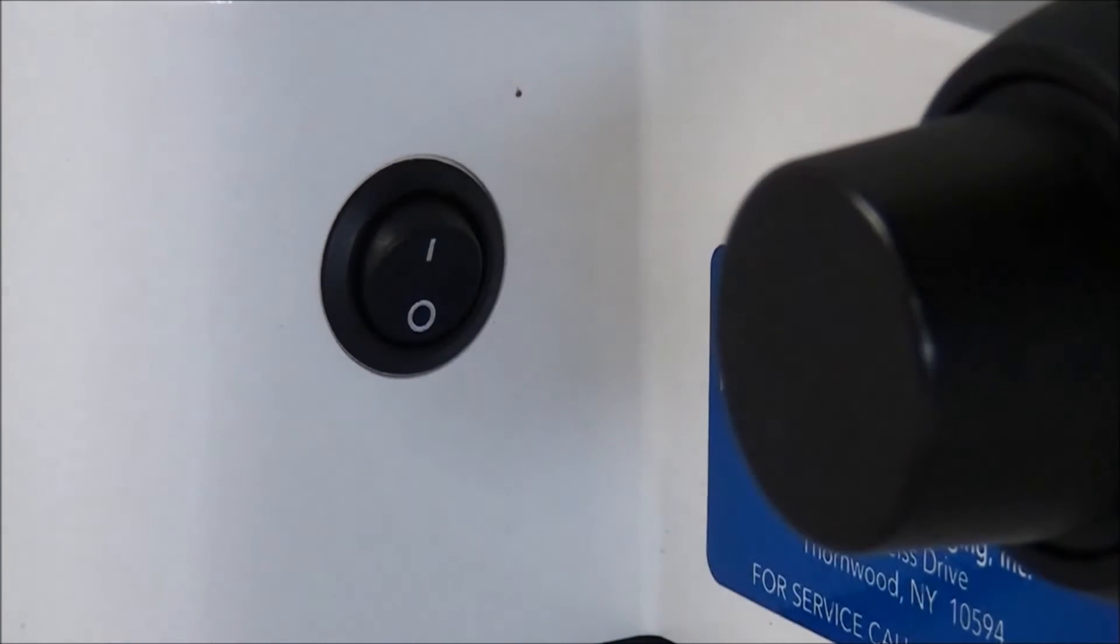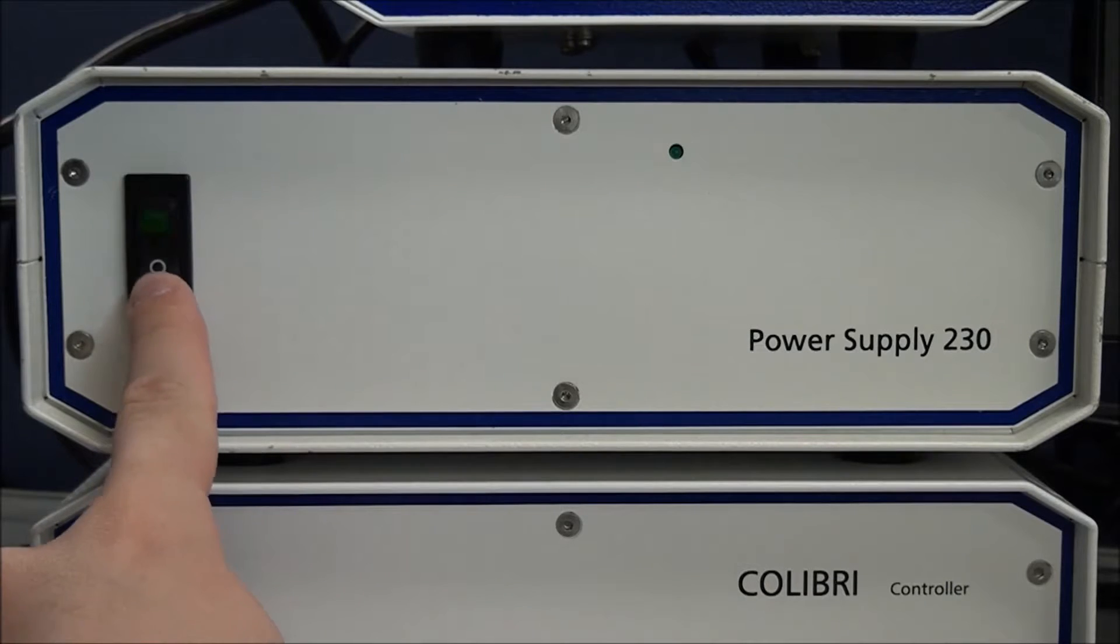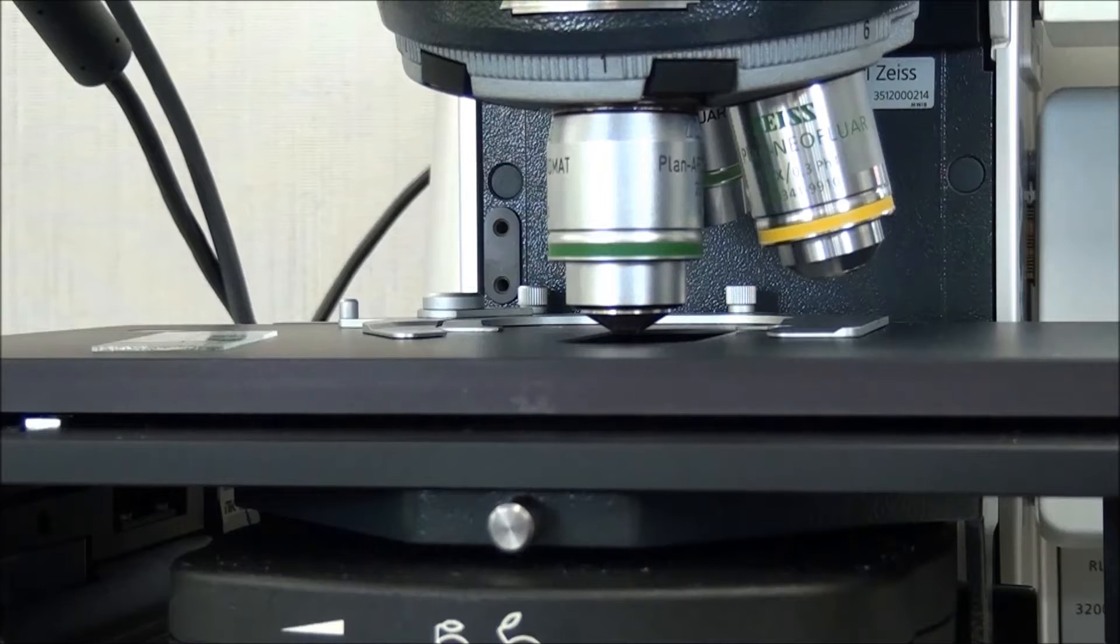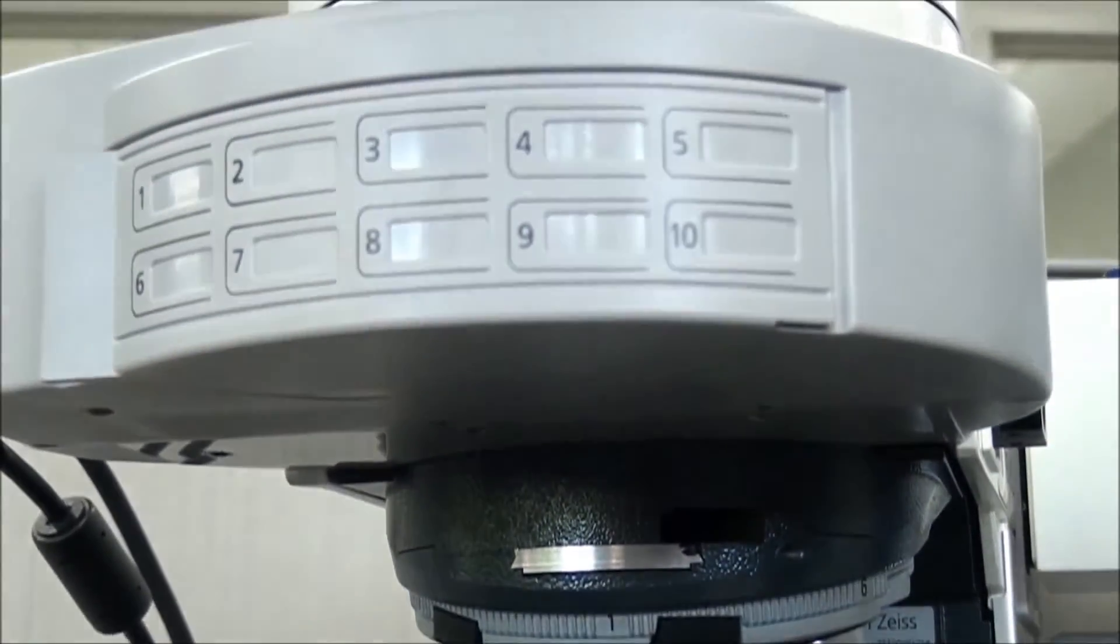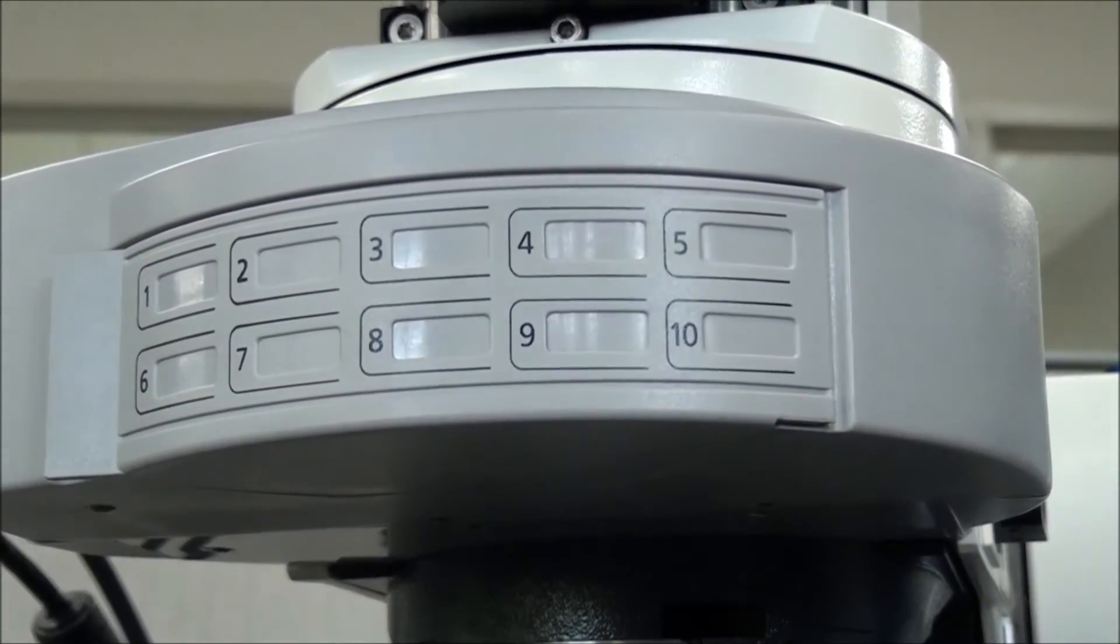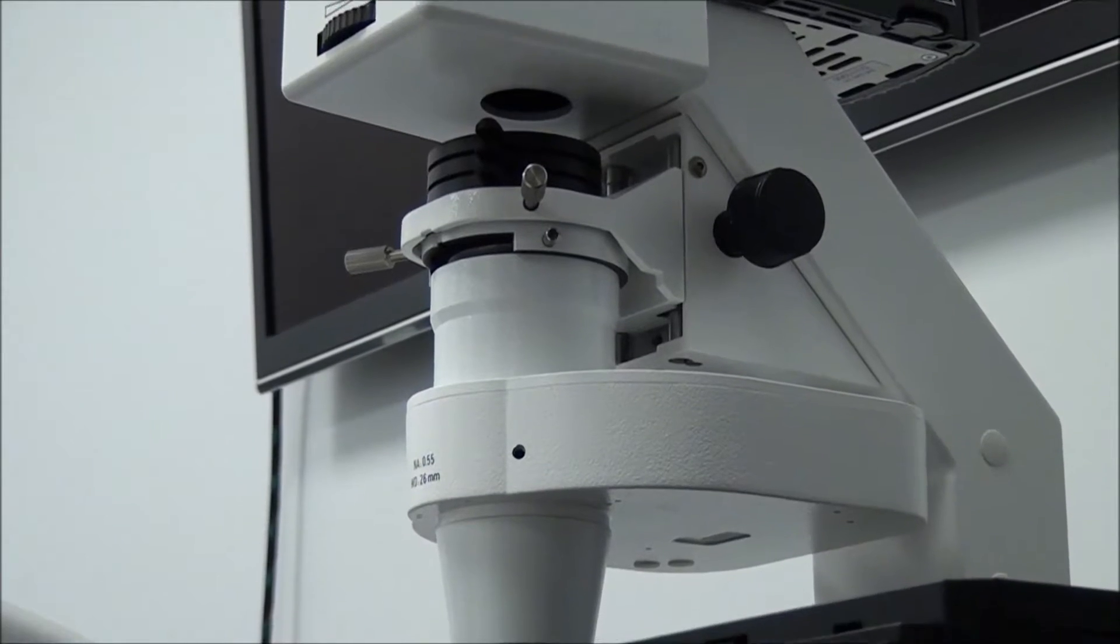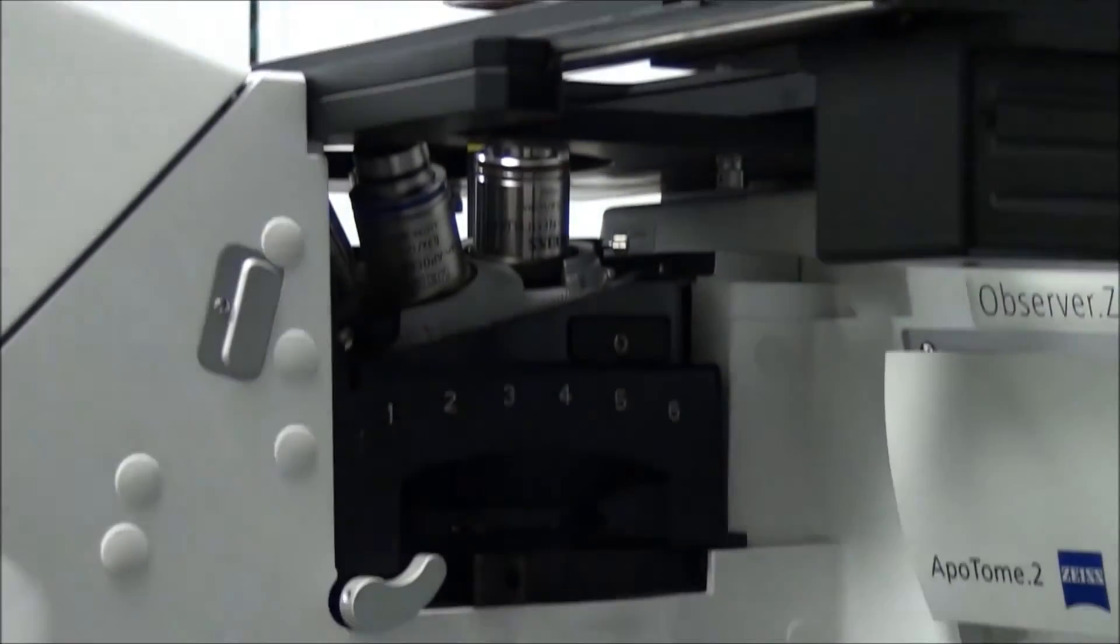Start by switching the microscope off from the stand or the attached power supply. Locate the reflector changer access door. On upright microscopes, this is a gray cover located above the objectives. On inverted stands, access is made through a panel underneath the stage.